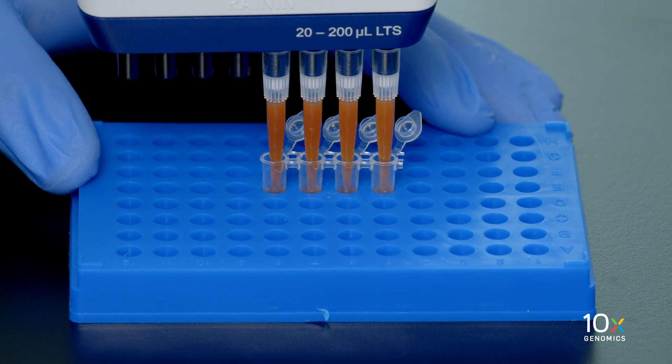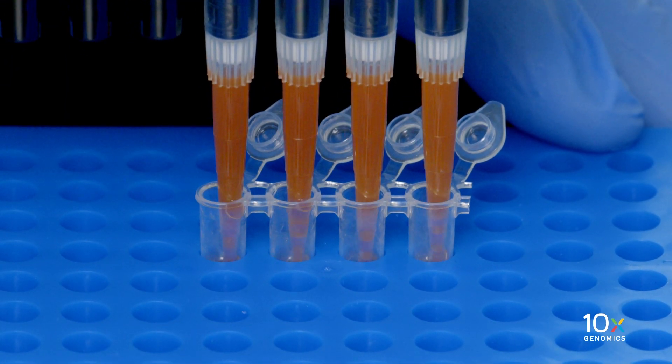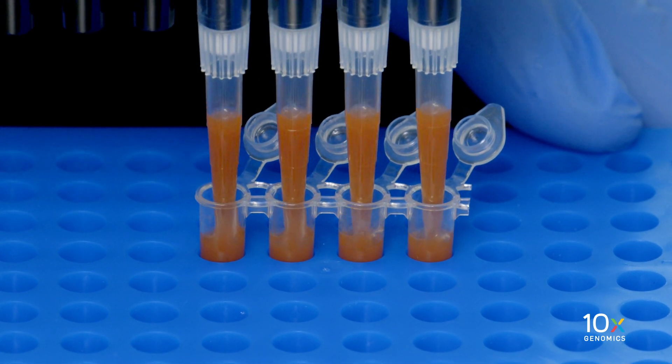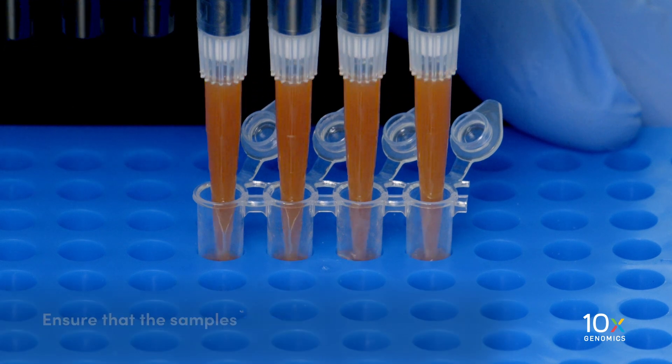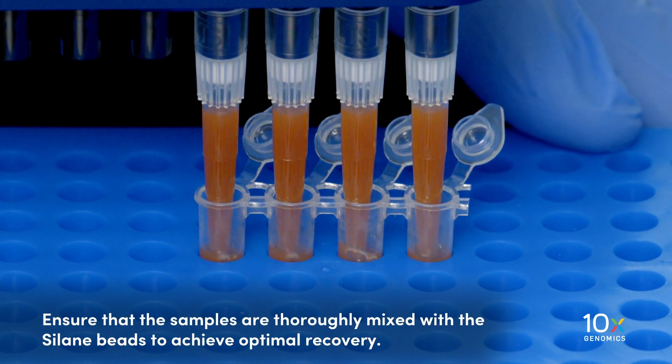Do not cap the tubes at this point because they are too full. Pipette mix again at approximately 5 minutes after the start of the incubation to resuspend the settled beads. Ensure that the samples are thoroughly mixed with the silane beads to achieve optimal recovery.